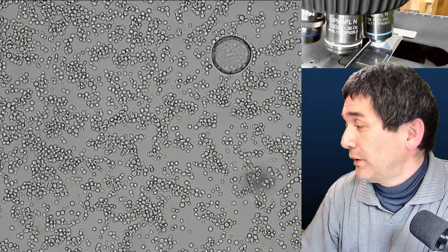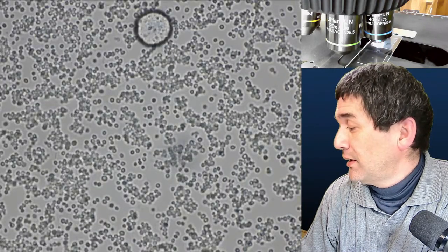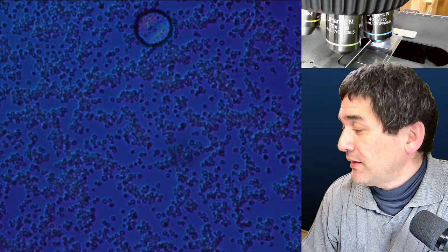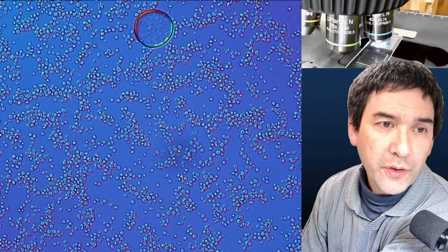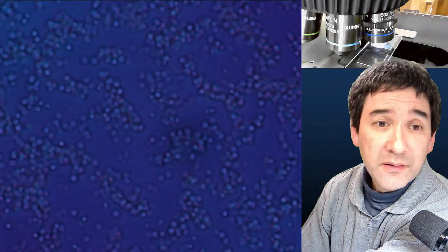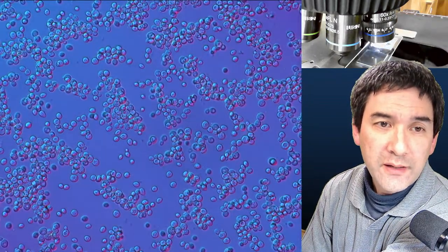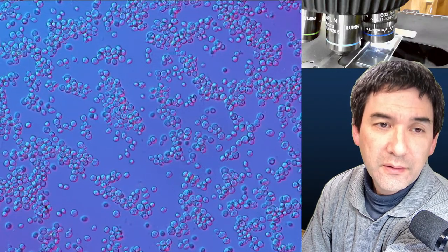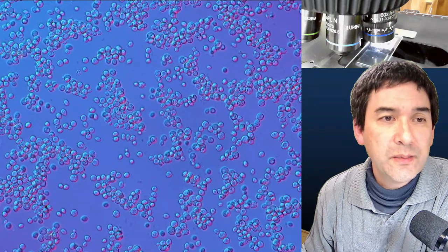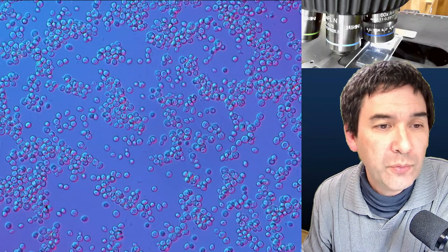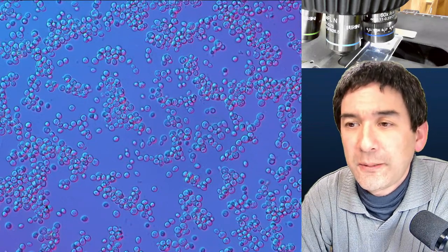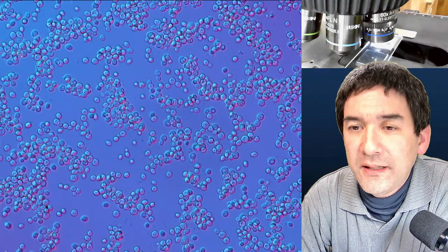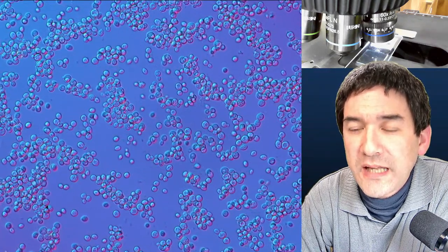Let's also switch to DIC for comparison. Now at 60x with DIC — notice how much darker it becomes, taking away a lot of light. But the cells do look more three-dimensional. At this magnification you can also see that some cells are compressed between the cover glass and the microscope slide, and some cells can show Brownian motion.